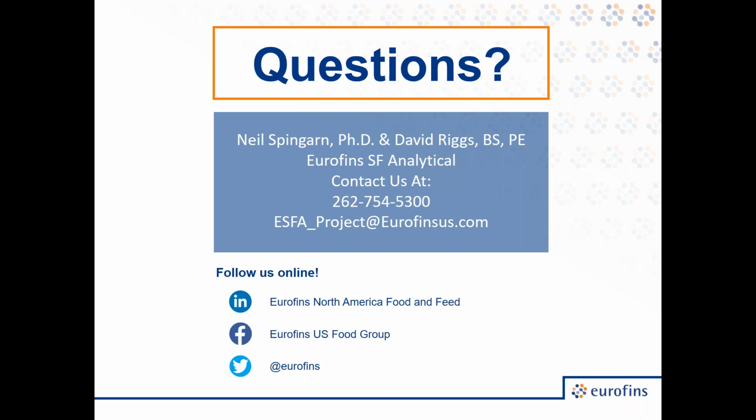All right, thank you, Dave. Our second question here is, is there a size limit on foreign material objects that Eurofins can detect using the techniques outlined in today's webinar?